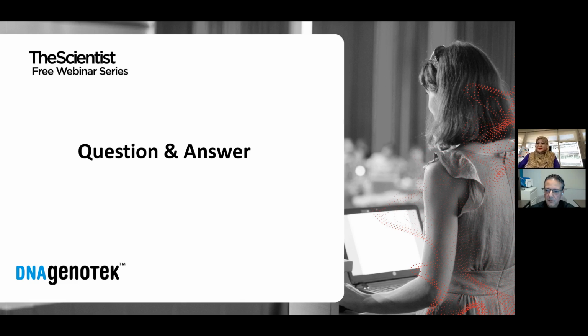Let's see, Mike, and we have an audience member who says, thank you for the informative presentation. I'm wondering if there is a workflow for extracting cell-free DNA in saliva samples.